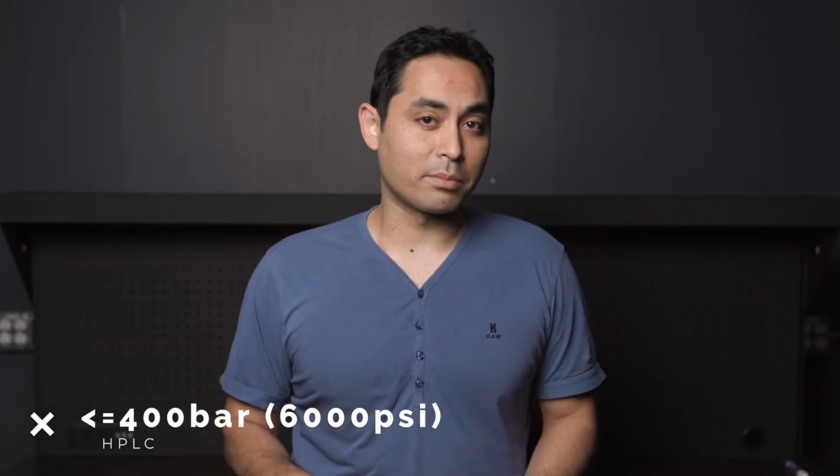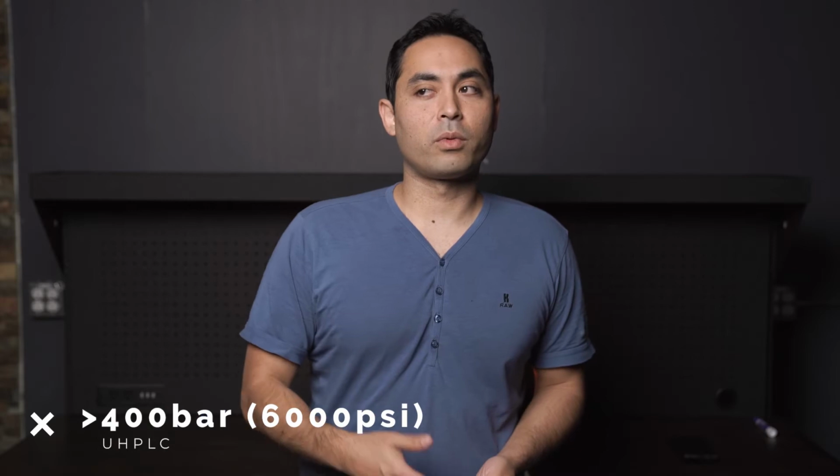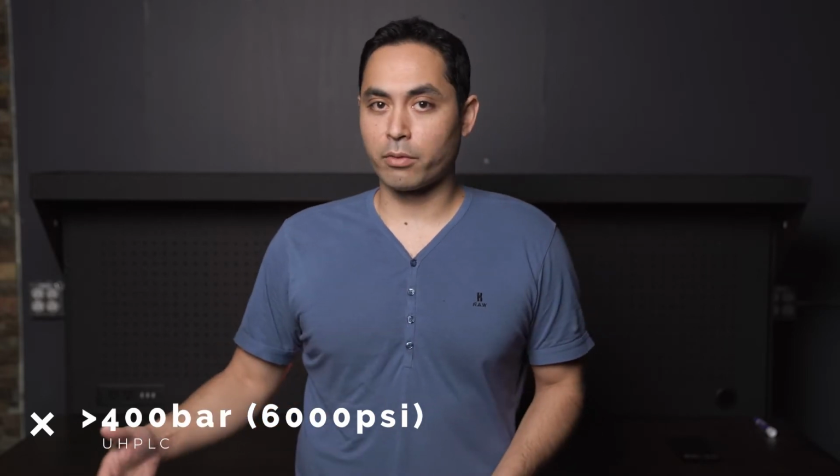Let's decide whether or not it's better to have an HPLC type application or a UHPLC application. And what does that even mean? The difference between HPLC and UHPLC is really dependent on the pressure. If you have around 400 bar and below, which is around 6,000 PSI, that would be more classified towards HPLC. When you start getting above that, then we're getting into the UHPLC realm.